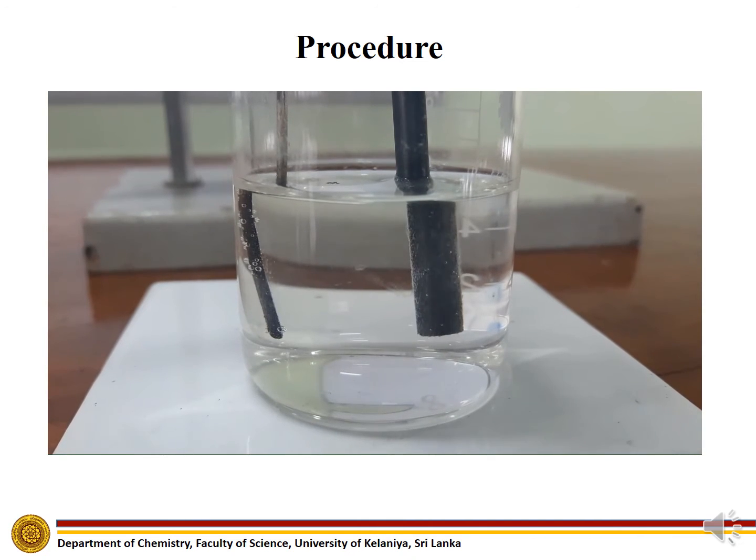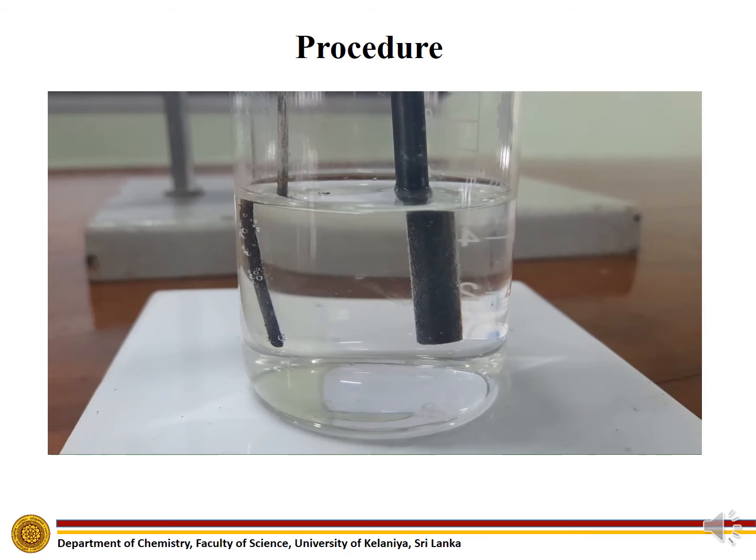Disconnect the power supply when silver chloride is fully developed around the silver wire.